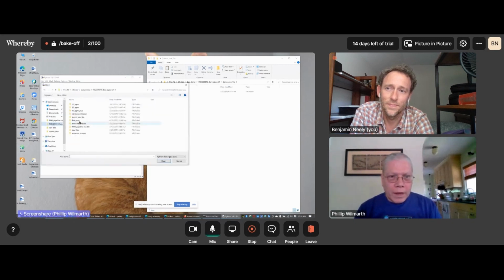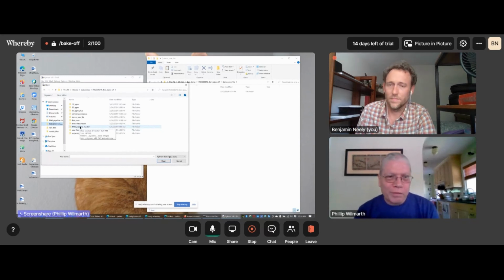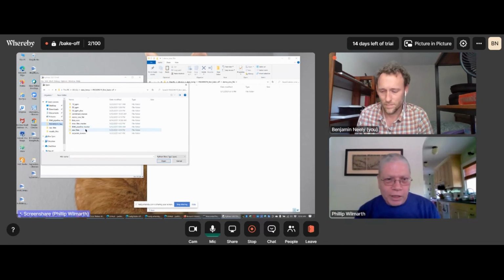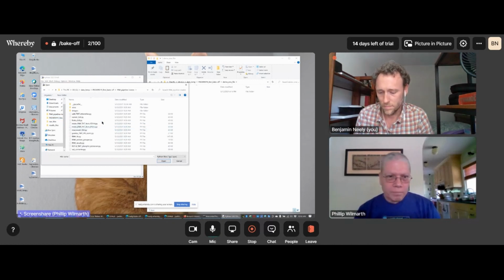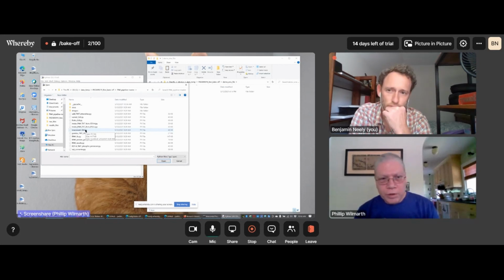Here I downloaded the pipeline files from GitHub as a zip archive, decompressed it, and then stuck the folder in here with the other Bakeoff files. So this is a copy of the scripts that are at GitHub. And the first one we want to do is our MS Convert GUI. So we've got basically a little GUI application that does the file conversion.